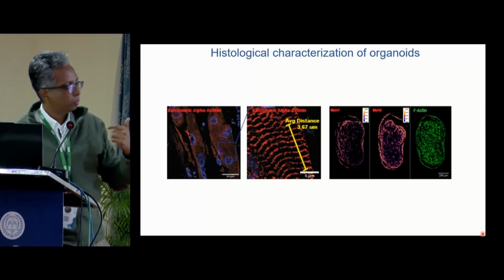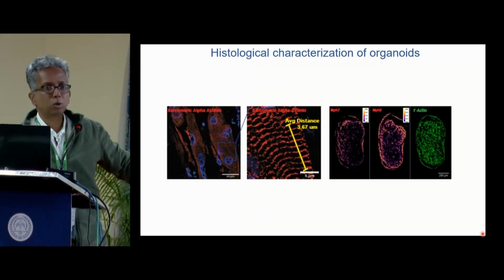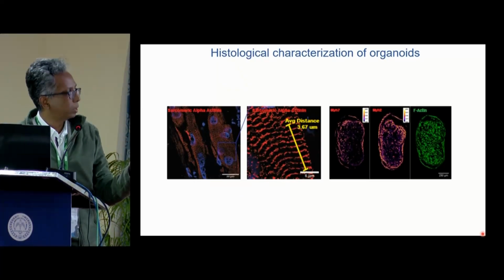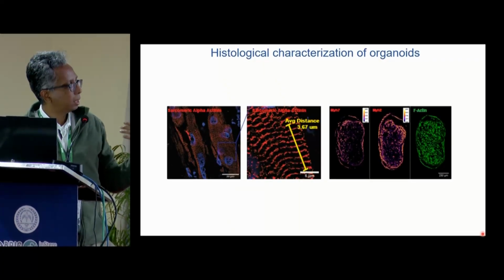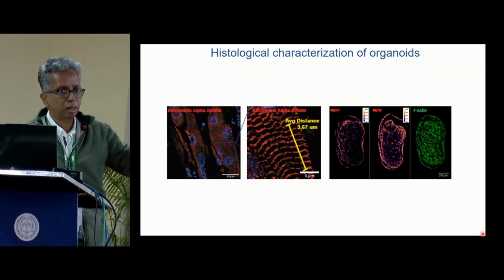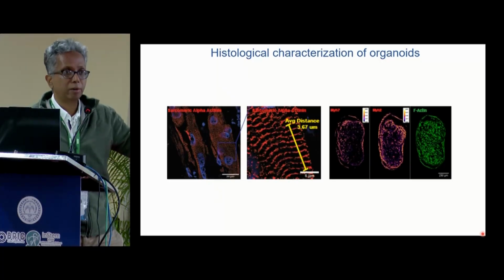Next, one of the things that you do not get in 2D systems is the formation of these beautiful sarcomeres that are important for releasing calcium and helping the contraction of the muscle. We can see well-aligned sarcomeres that start arising at day 14. The sarcomeric distance is also very similar to what you would expect in a human being, and different from a mouse. To our knowledge, this is one of the more mature fibers that we have been able to generate.